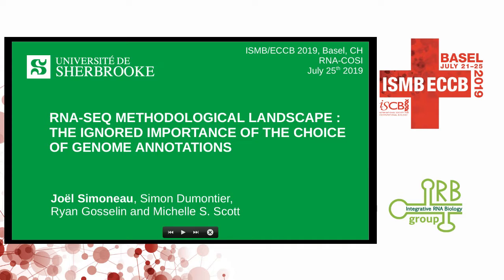Thank you, Michelle, for the introduction, and I'd like also to thank the COSI for the opportunity to talk here. So today I want to put forward the idea of community oversight in RNA-seq and also highlight the importance of genome annotation in RNA-seq quantification.